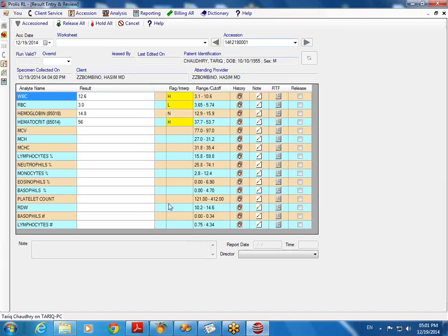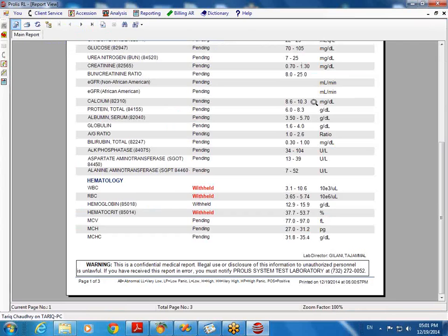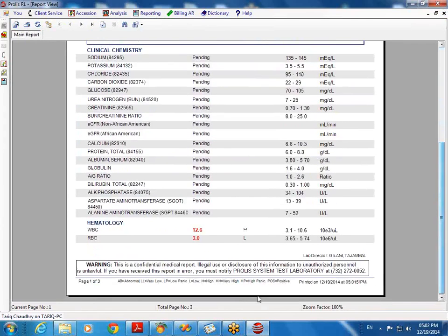Nothing is released, that's why. Let me release everything and refresh it, and we are good to go. I can refresh the same report, and it will display the results. Give it a second, it's refreshing. Okay, like this. I see.